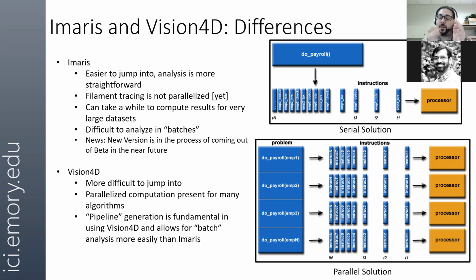They don't affect each other. And so you can give that out to the various central processing units a computer has. So if you can parallelize something, send it off to a CPU. If that CPU has a lot of cores, like our workstations do, then you can analyze it much more quickly because all of the parts are being calculated at once.